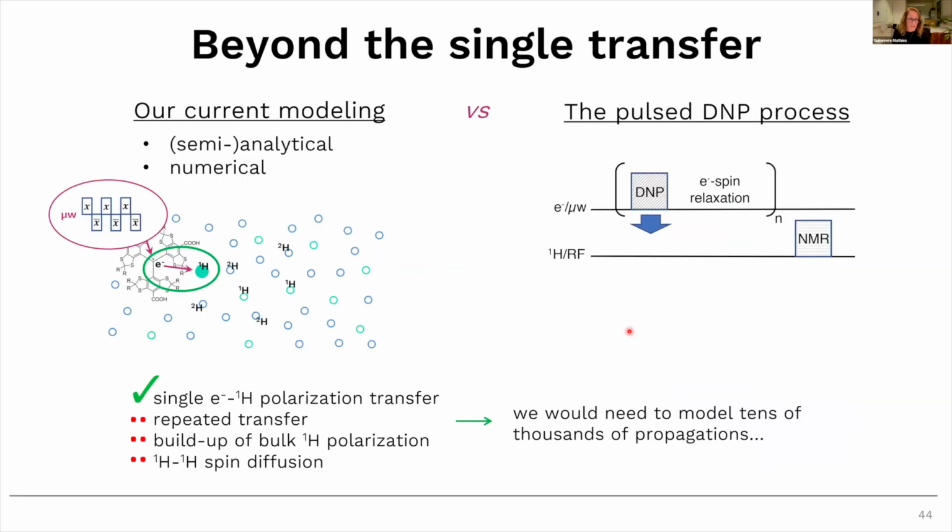Okay, so on our side, there have also been some new developments. What's been bothering me about the simulations and the analytical description that we've been doing so far is that we're only considering the single transfer. So we're just considering one transfer from the electron to the proton space. This is what our modeling was based on, both the analytical modeling and also the numerical simulations.